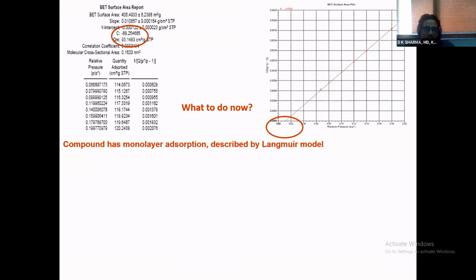And because that was the only material he was studying, he thought he had come out with a very nice adsorption model. Obviously, when people started studying other materials, they didn't find any validity for the Langmuir model, and hence somebody else had to come out with, not somebody else, but Brunauer, Emmett, and Teller had to come out with this combined theory of multi-layer adsorption.